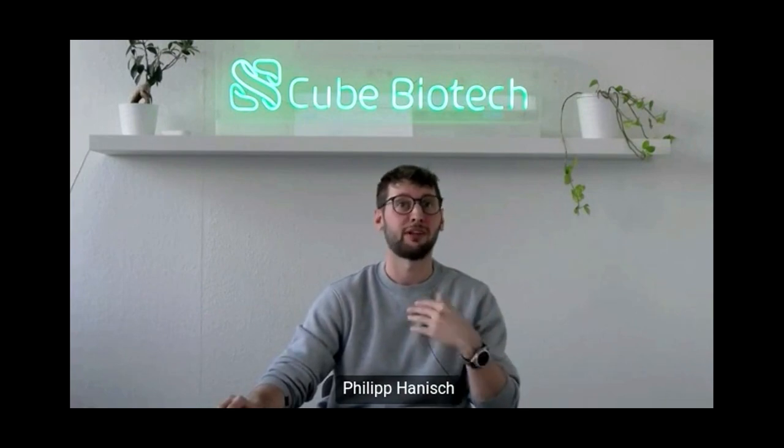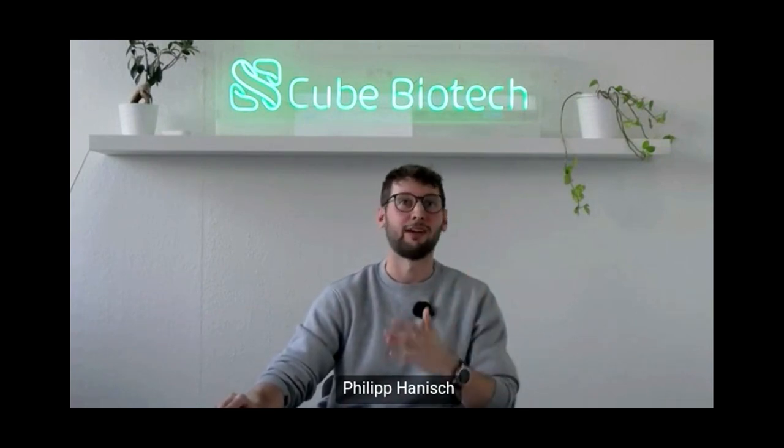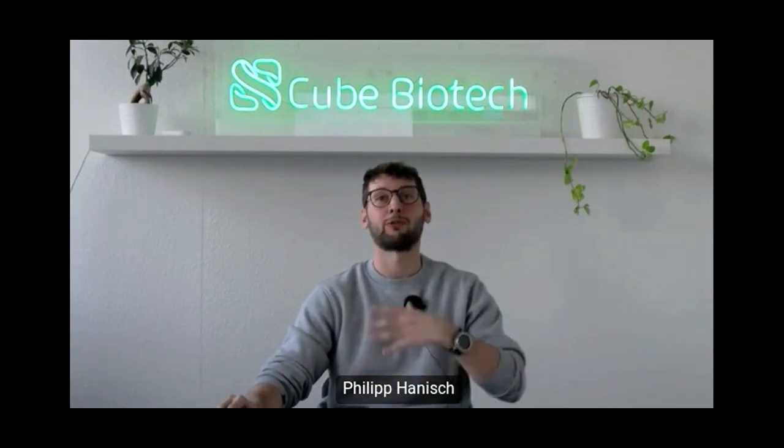Then immobilization applications. So you can use it for ELISA, you can use it for phage display, binding studies, high throughput screenings. This all becomes now possible. You can do ligand screenings, like, of course, SPR. This works, we have tried it. Spectral shift, also with a NanoTemper device, works wonderfully. GCI, we have tested it, works. DEL screening also works. So you see there's a lot of possibilities next to cryo-EM or to structure.